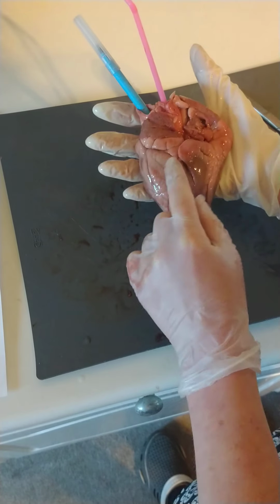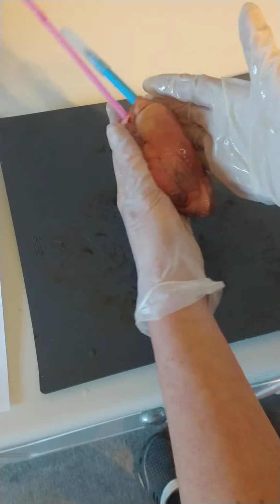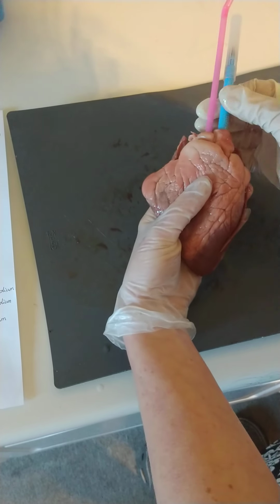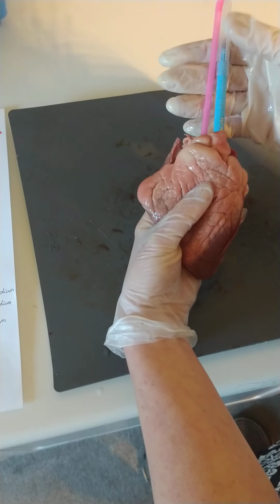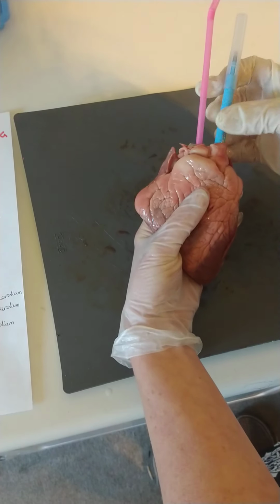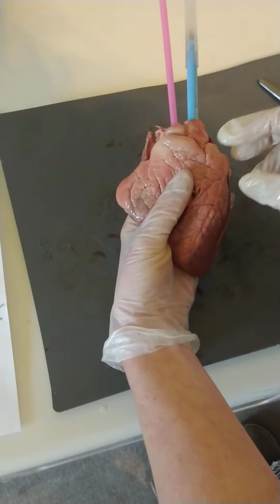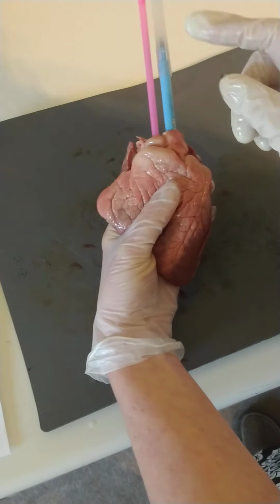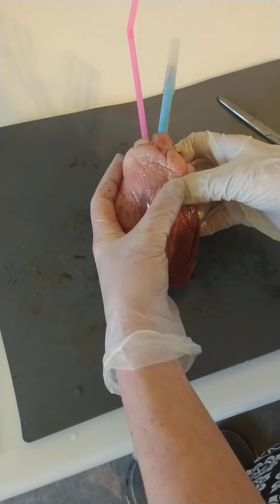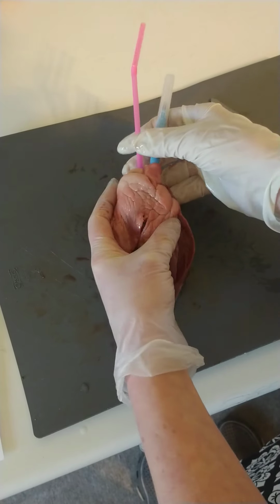And when we turn it around, we can see that this must be the front, because we have our aorta and pulmonary artery here, and the aorta is a bit thicker because it needs more strength to pump the blood around to the body, and the pulmonary artery is a little bit thinner because it only goes to the lungs. So let's see what the blood flow does.